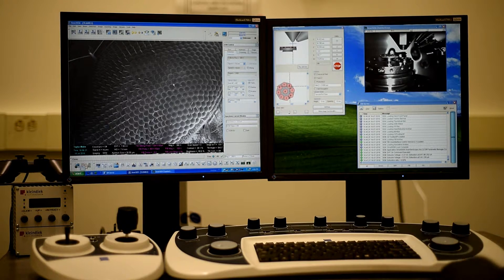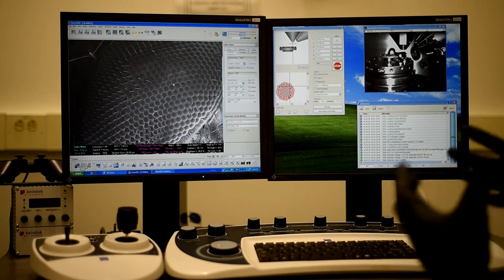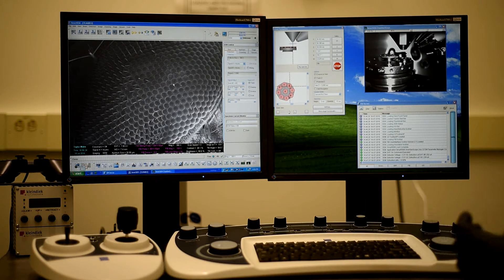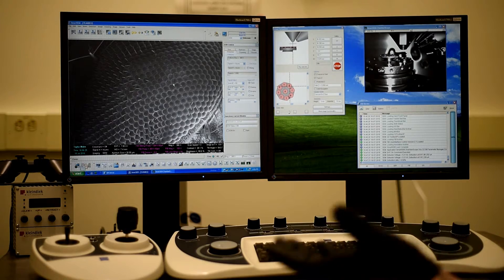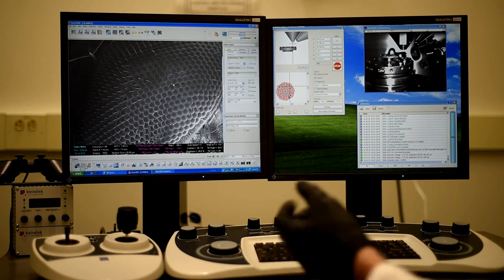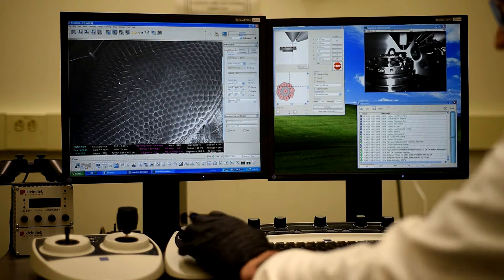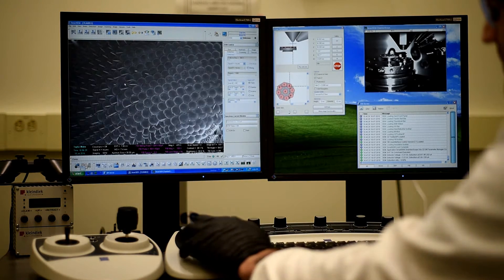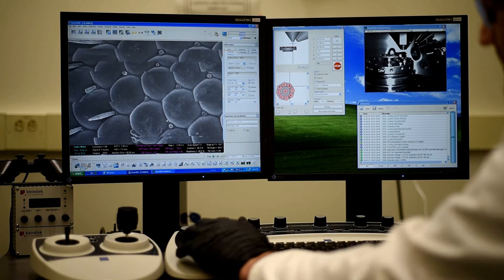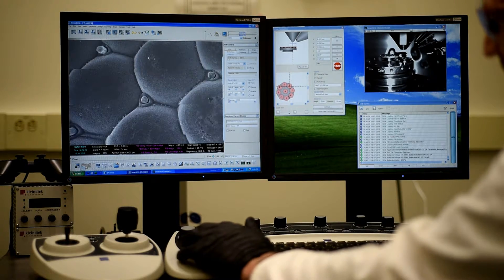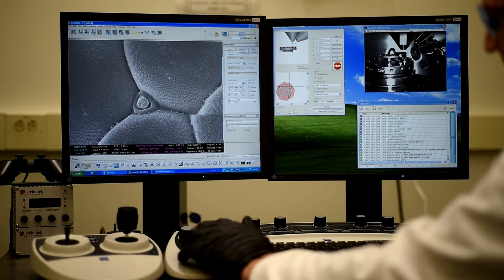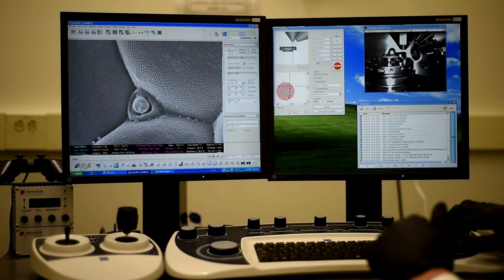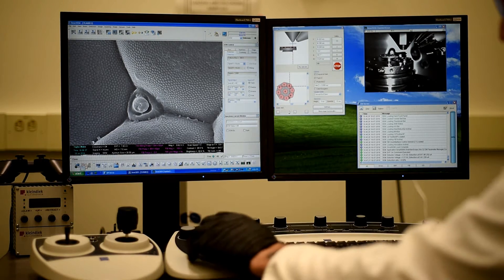So none of this stuff is super fine resolution. We're magnified a couple hundred times. But say you wanted to go way in. You know, we wanted to keep going way in to thousands and thousands of times. Well, here's one of these eyes that keep going in. So now we're going to adjust the fine structure.